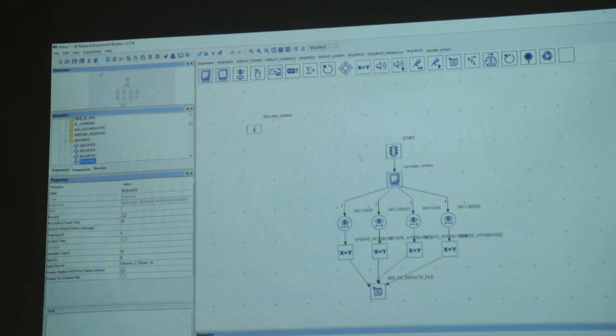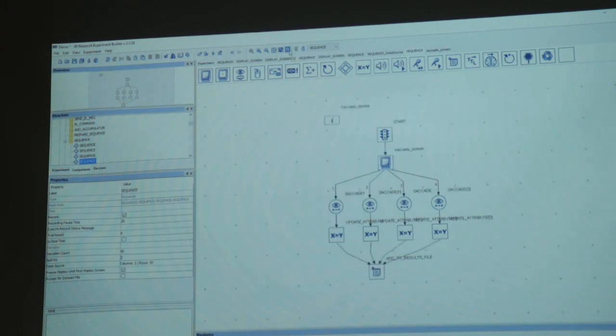Yeah, and now before the instruction there was a break and everything in the data source, and now we have the main design. So this is it. This is how your experiment is designed. Once you've made it, you don't have to do much. No piece of code has to be written. You just have to drag it down, link everything up, and it runs on its own.